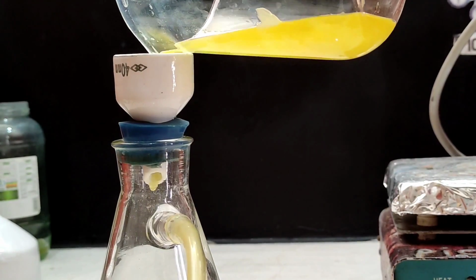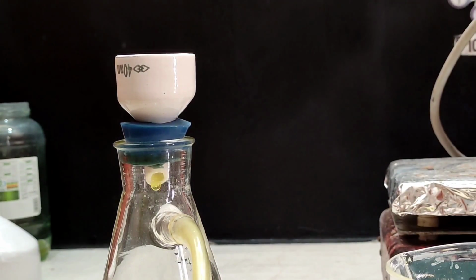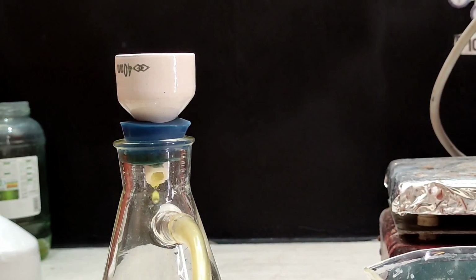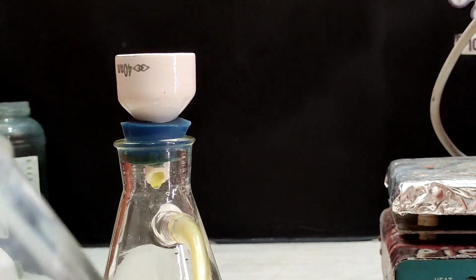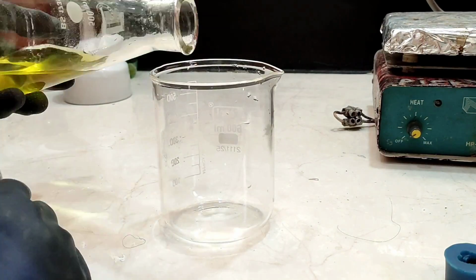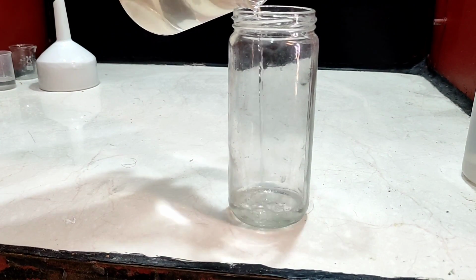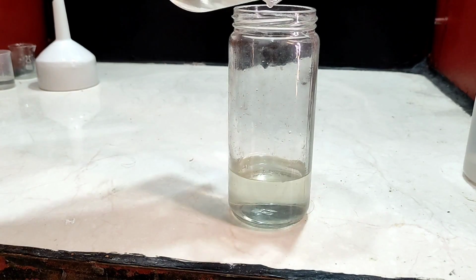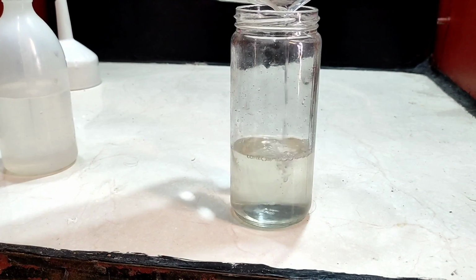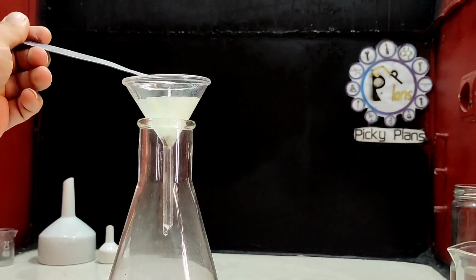Since the nitric acid batch was contaminated with copper, it was necessary to refine it, and the gold was redissolved with some bleach and hydrochloric acid and vacuum filtration carried out. Afterwards, the filtrate was transferred to a beaker and SMB added to drop gold. Then the gold powder was boiled. This helps the fine powder stick together and be accumulated much more easily. Gold powder was washed a few times with water and filtered through filter paper, then some sodium carbonate and borax were added to start the melting process.